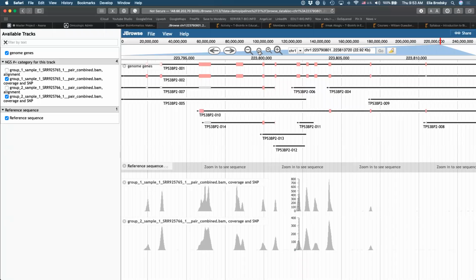Yeah, so Simai is suggesting that this is exome. Why do you think this is whole exome? Okay, so what specific regions, and how do you know what regions we have here actually? All right, excellent. So coding regions. How did you determine that these are coding regions?